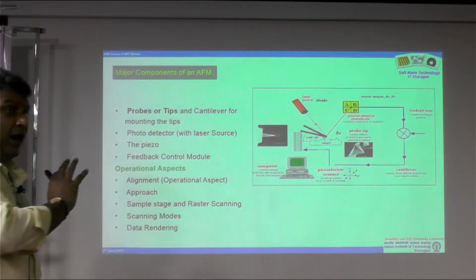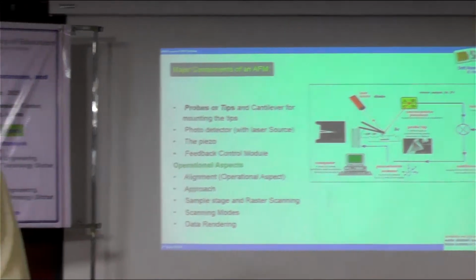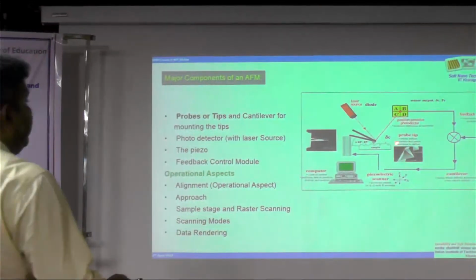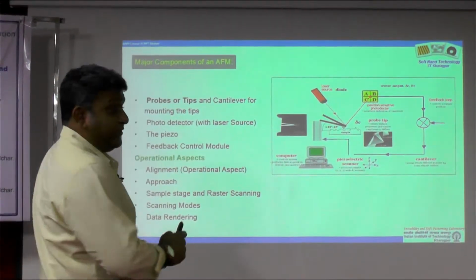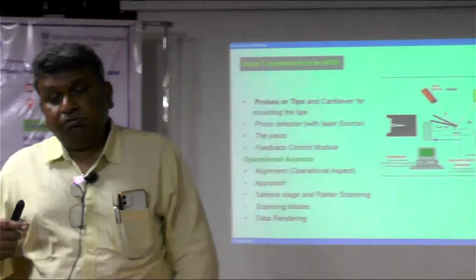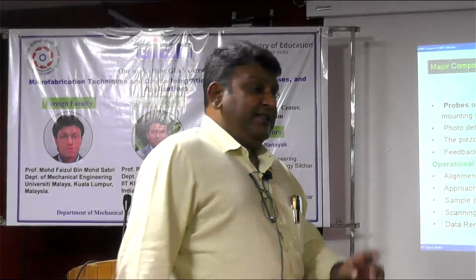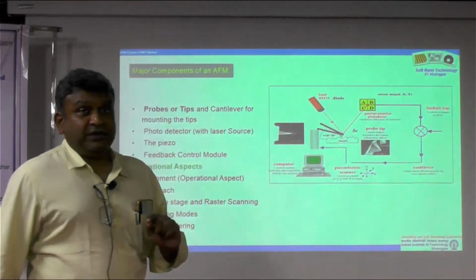This is the basic hardware setup of an atomic force microscope. This is also very interesting. Since my previous speaker talked about piezoelectric material, that makes my work easy, because you already see here the words piezoelectric scanner. This tip, as I mentioned for the STM, is mounted on a piezoelectric scanner here also. But there is one problem that arises.